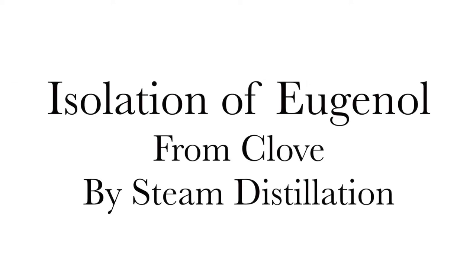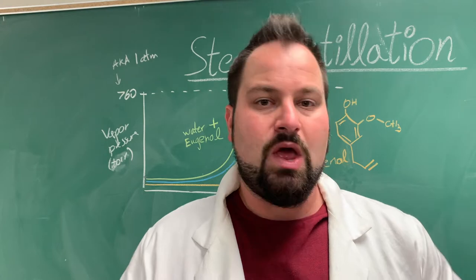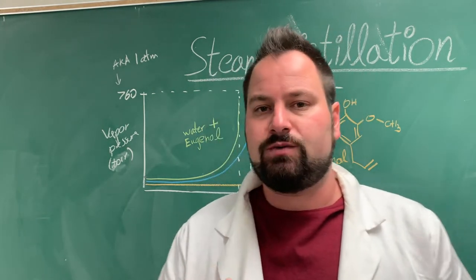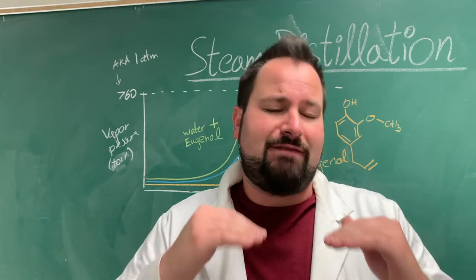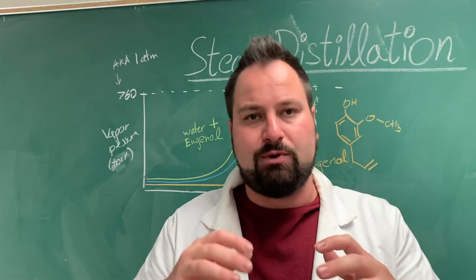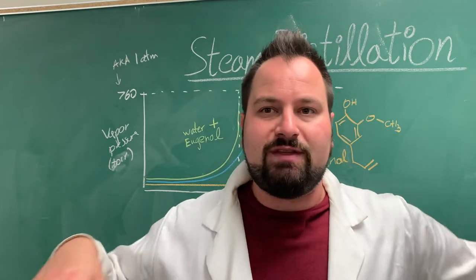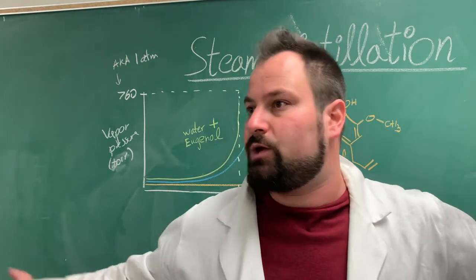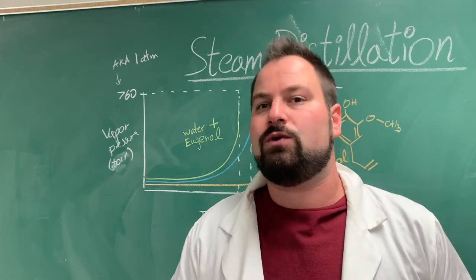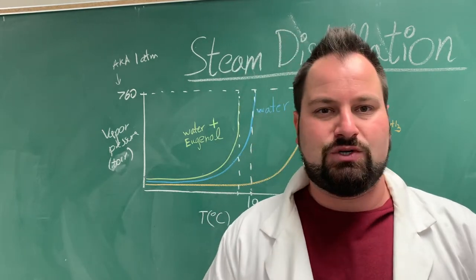Isolation of eugenol from clove by steam distillation. Okay, let's start off with a quick review. Why does something boil? Why does it evaporate? In general, this happens because the vapor pressure of that compound has matched or exceeded the vapor pressure of its surrounding environment. Our surrounding environment near sea level on Earth is about 1 atmosphere or 760 torr.